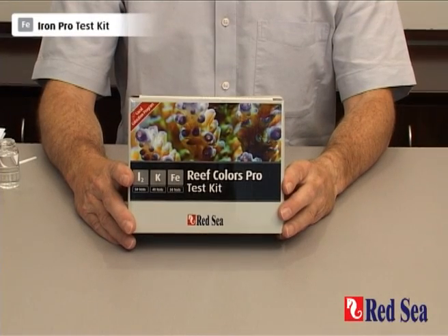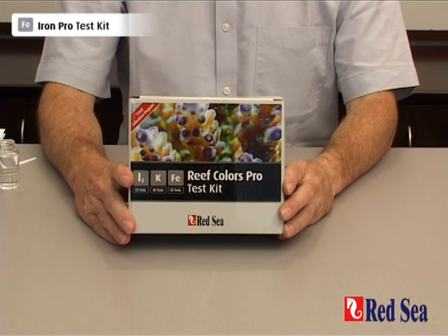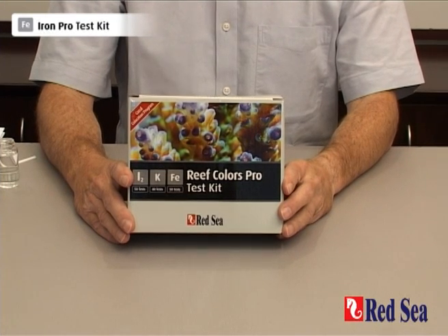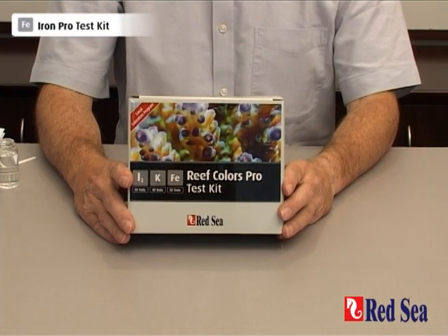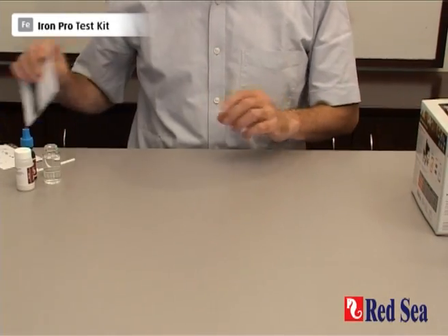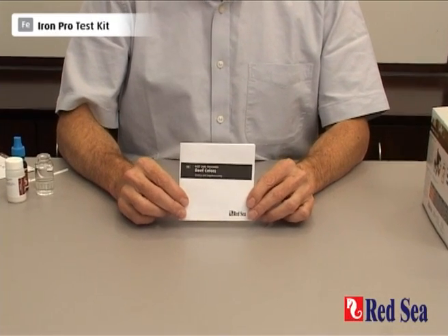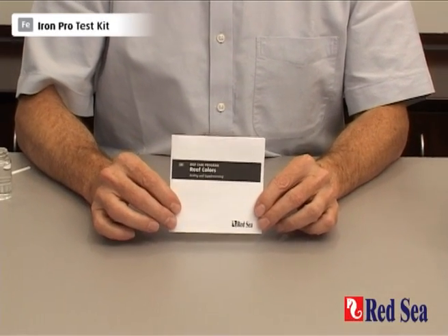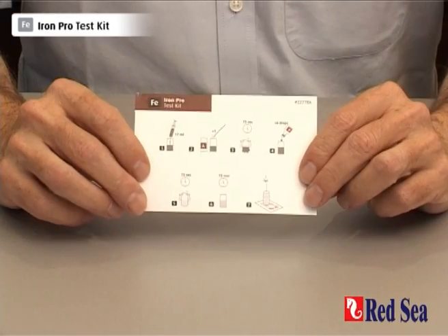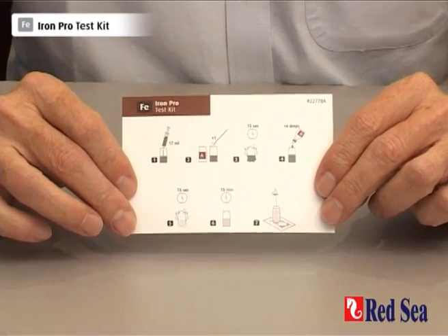Thank you for purchasing Red Sea's Reef Colors Pro test kit, which includes the iron kit. The purpose of this video is to demonstrate the use of the iron test. Before performing the test for the first time, make sure you read the instructions in the manual provided. There is also a color card with graphic instructions for when you actually carry out the test.